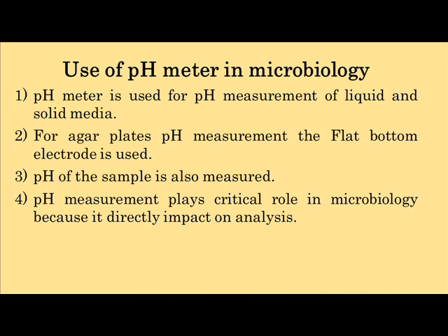Use of pH meter in microbiology. A pH meter is used for pH measurement of liquid and solid media. For agar plates pH measurement, the flat bottom electrode is used. The pH of the sample is also measured by using a pH meter.